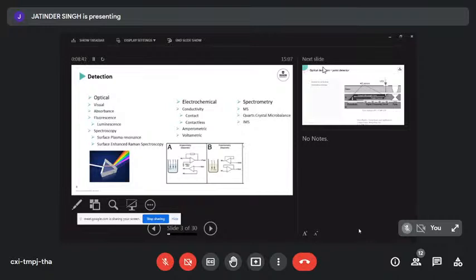As we've seen with the flow injection analysis before, if you've got a colored LED and a photodiode detector, you actually already have an absorbance cell, and you can adjust that to different colors. If we want to go more sensitive, but also a little bit more equipment heavy, as we'll see later, we can go fluorescence detection.